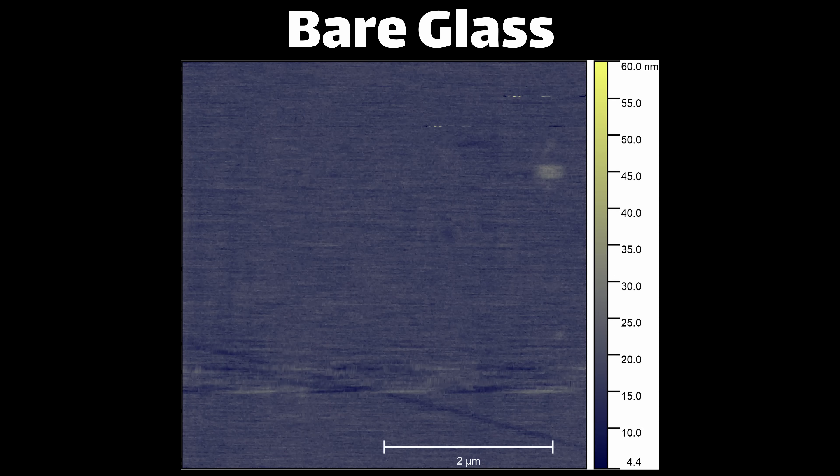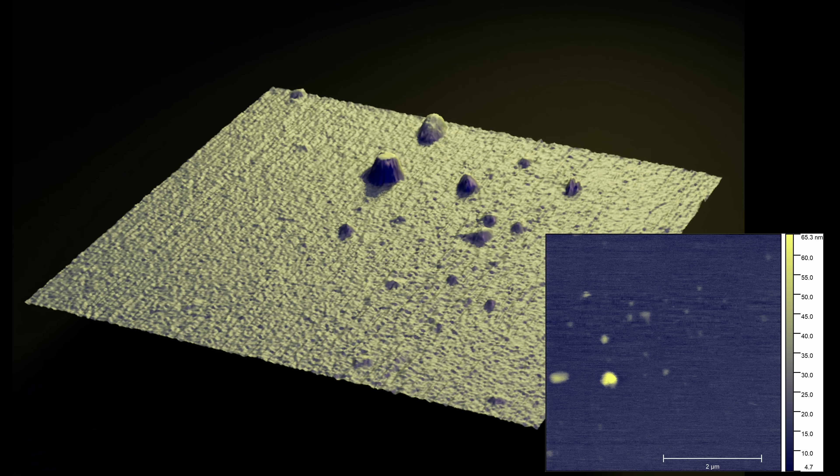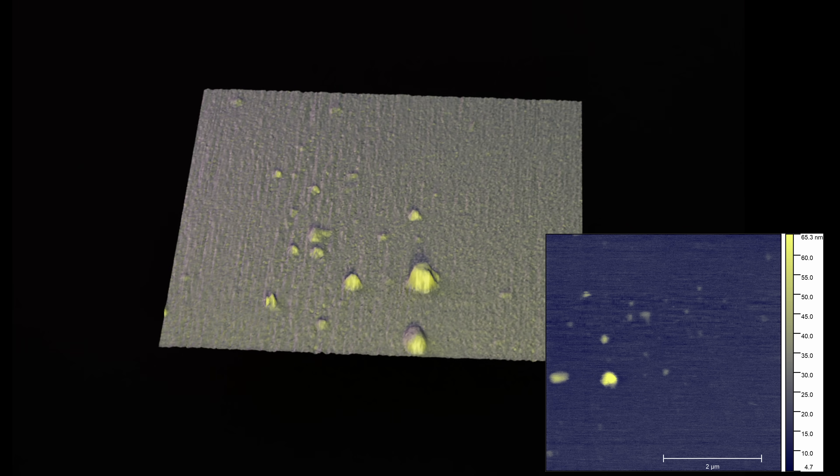First up, just for context, this is a scan of bare glass — just the microscope slide with nothing on it, basically what you'd expect with nothing in the field of view. It is basically flat to a couple of nanometers. If we go over to the ceramic spray side, we can see not a whole lot. There are some particles floating around, and depending on which field of view we look at, there are more or less particles. These little blobs are between 50 and 100 nanometers, which is kind of in the size you'd expect for silica nanoparticles, assuming that's what's in it.